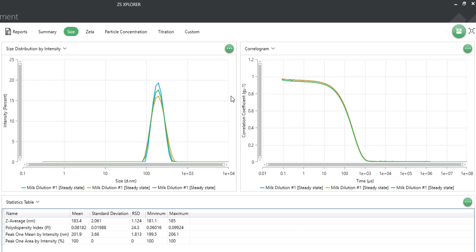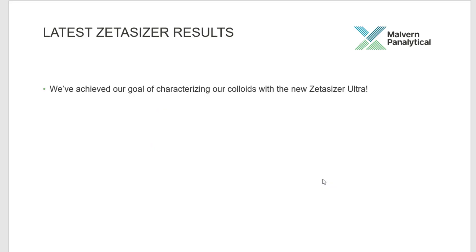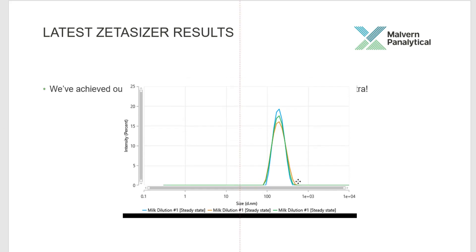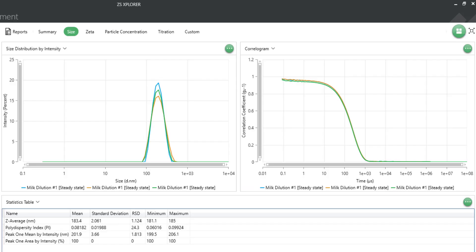Selecting copy image will place a copy on your clipboard that can be pasted elsewhere, such as a last-minute presentation. Copy image not only works on graphs but tables as well.